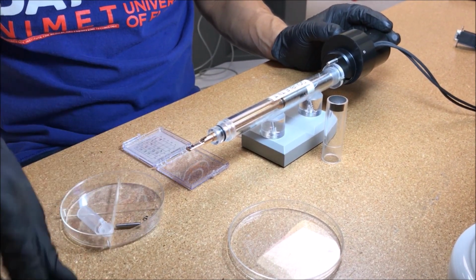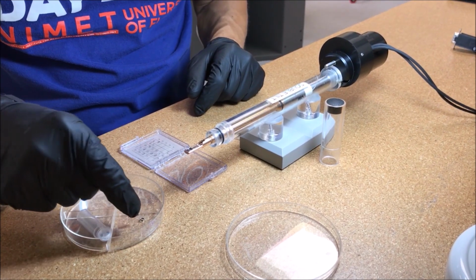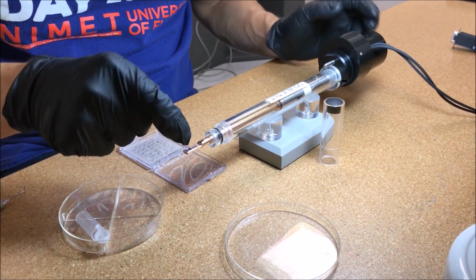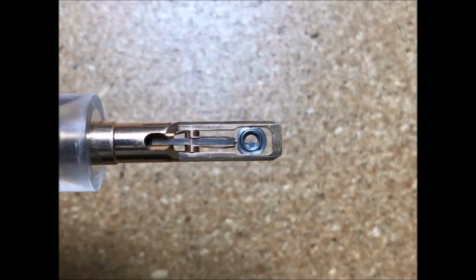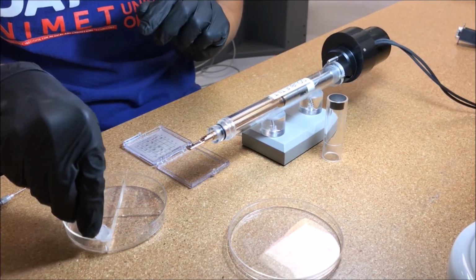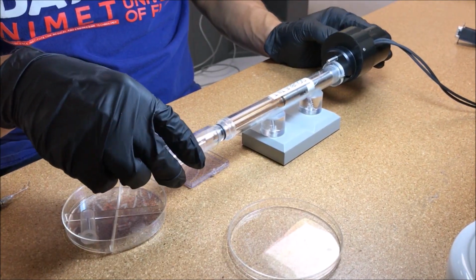Use the hexagonally shaped side of the hex ring tool to pick up the hex ring, making sure the threaded side of the ring is oriented down. Secure the hex ring into the basket by carefully turning clockwise. When finished, replace the hex ring tool into its container and replace the protective plastic cover onto the support base for the holder.